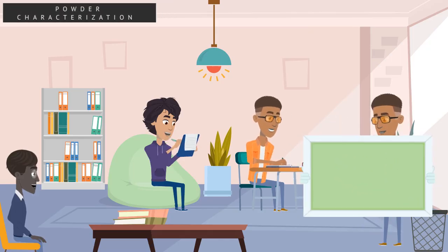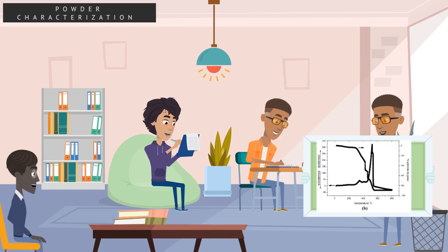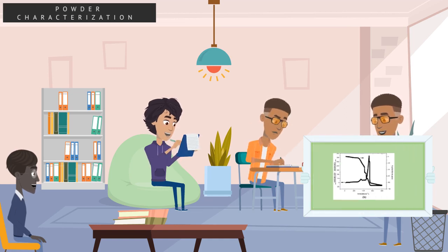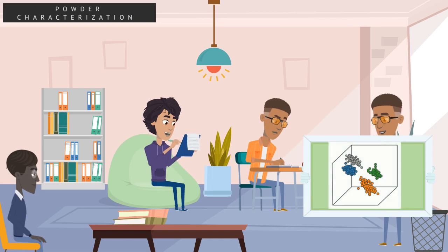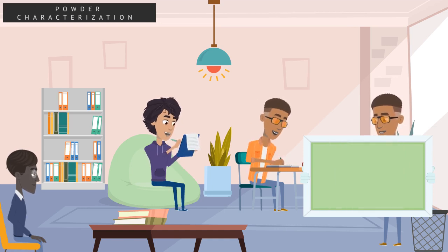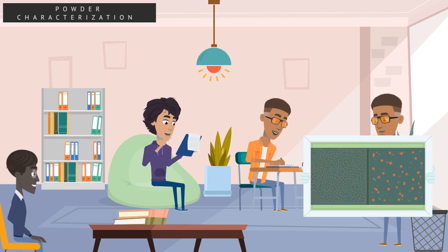Characterization of the ceramic powders, carried out for the two methods, was made via thermal analysis in a dry air atmosphere. With this technique, the temperatures where phase changes occurred, phases of organic decomposition and crystallization processes were determined. The results show the particles clustering up for both samples. A suggestion to correct this was to add a grind stage or a surfactant such as oleic acid with the purpose of generating a steric effect and thus separating the particles.